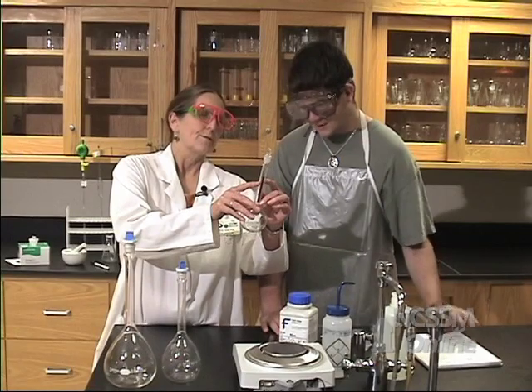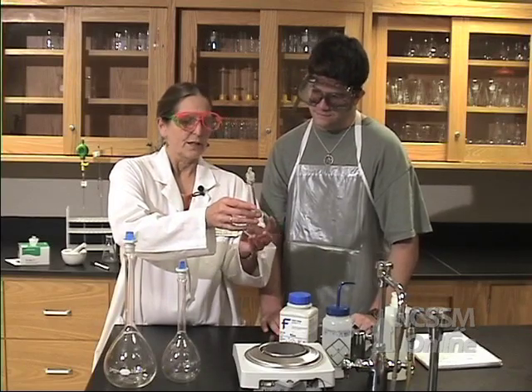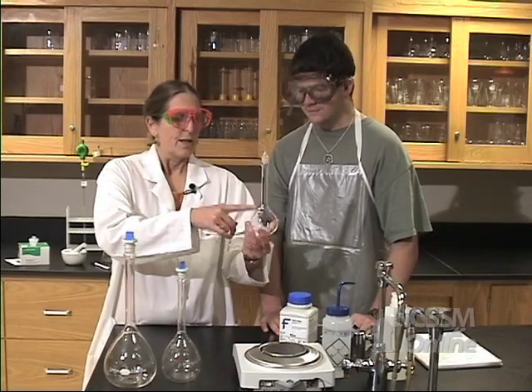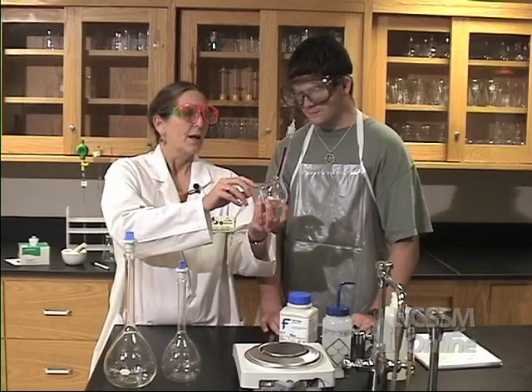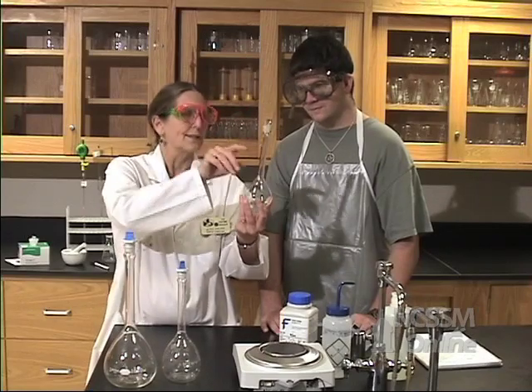See that mark right there? It's very precisely etched in the glass. This is a 200 milliliter volumetric, and what you're going to do is fill it about half full of water, measure out your sample, add it, swirl it around to get it to dissolve, and then fill it exactly to that level. Remember the meniscus? The bottom should be right there.